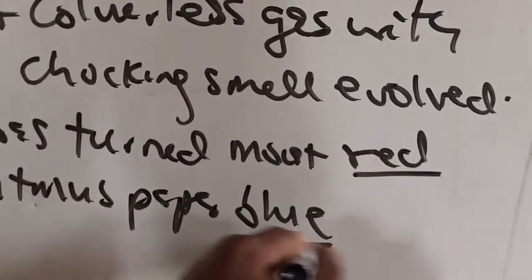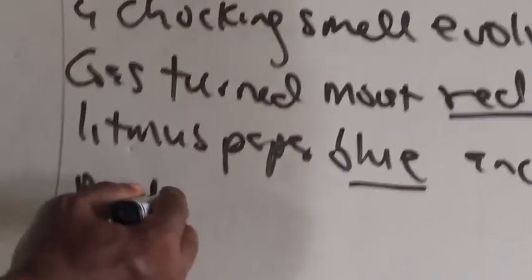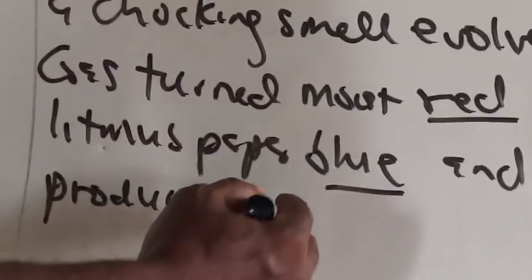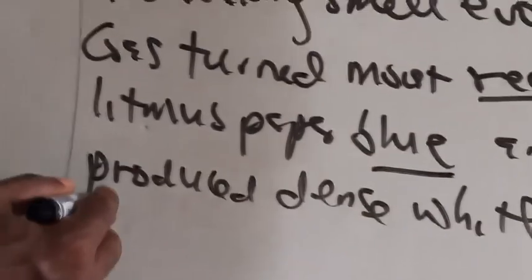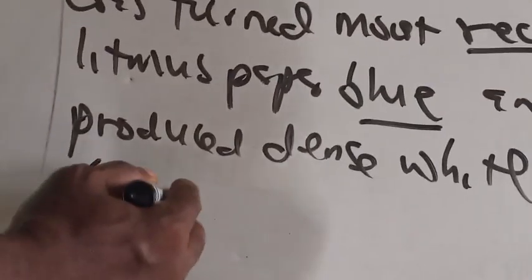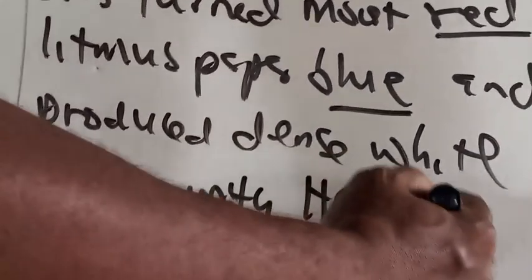Look at the color. And produced dense white fumes with HCl vapor.